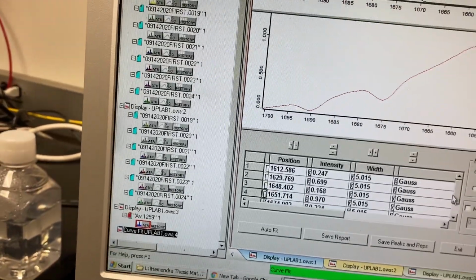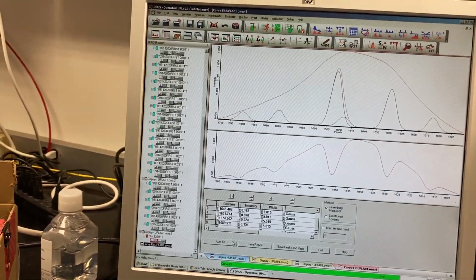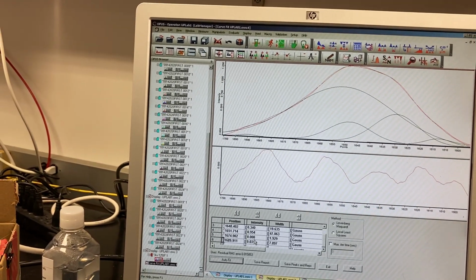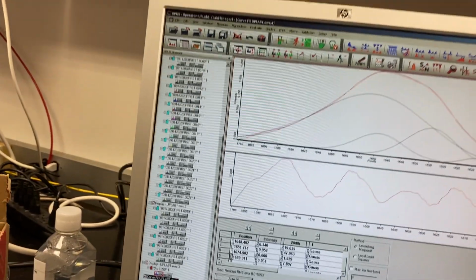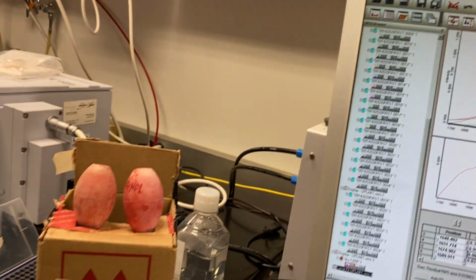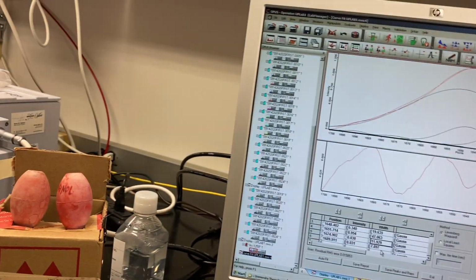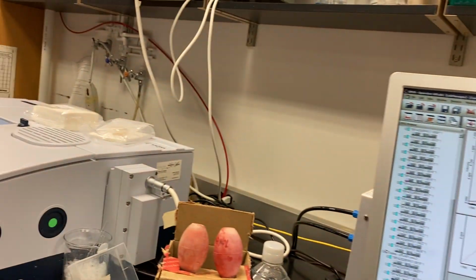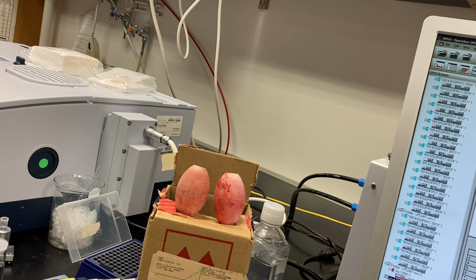So I just unselect the position, because I can approximate this position from my earlier study, and then auto fit, it will fit. This one is 0. Yes, the program does not work every time, because the spectral data is sometimes difficult. So you can play with that program by changing the position, by changing the intensity. So this is your duty. Now play with that for a little bit of time.